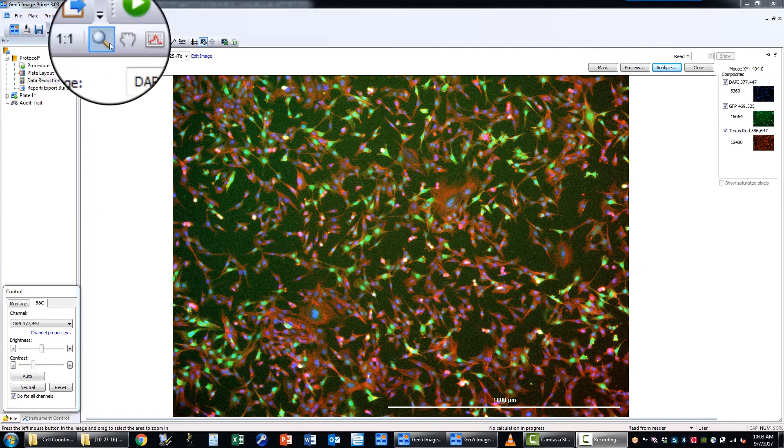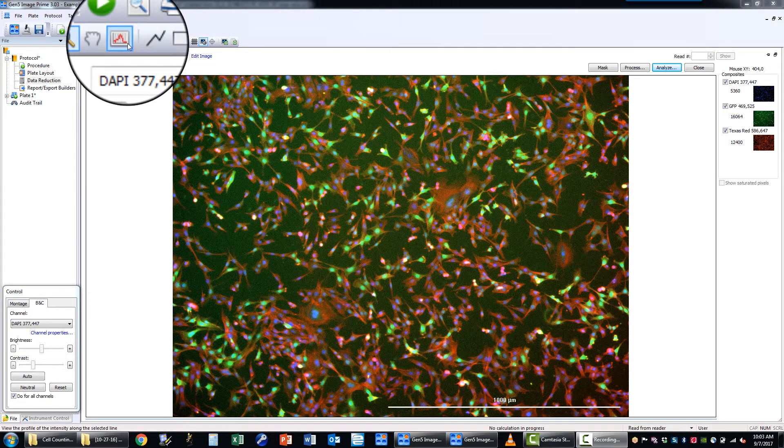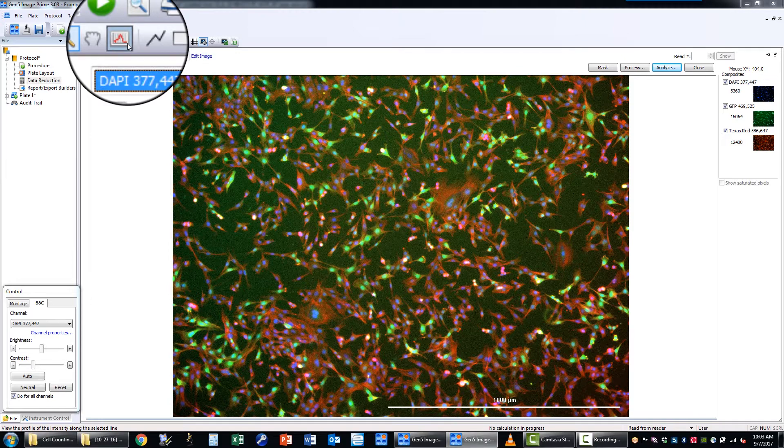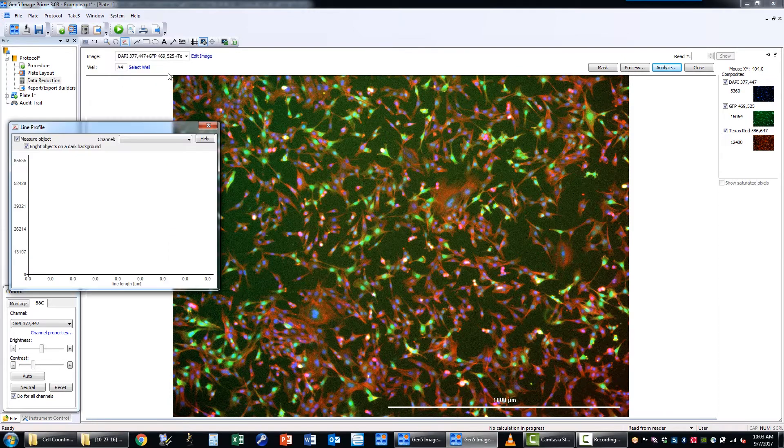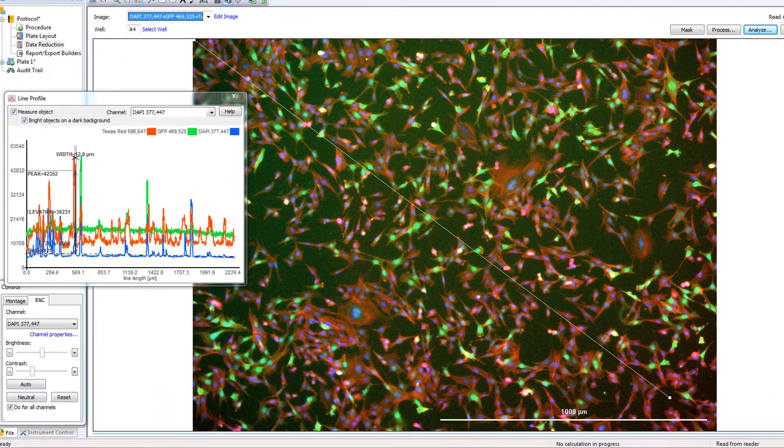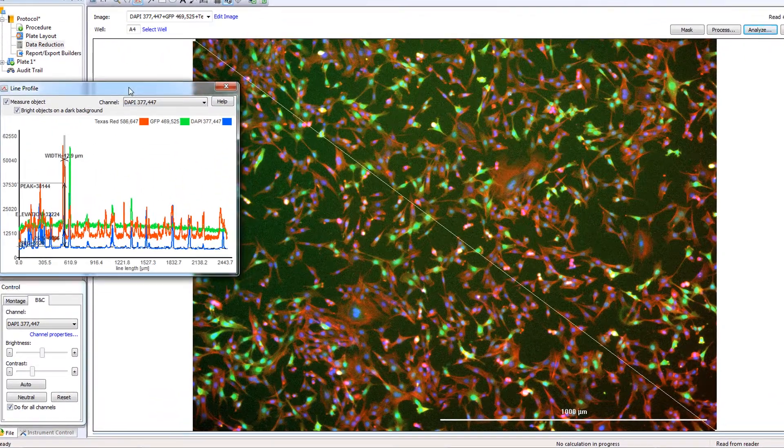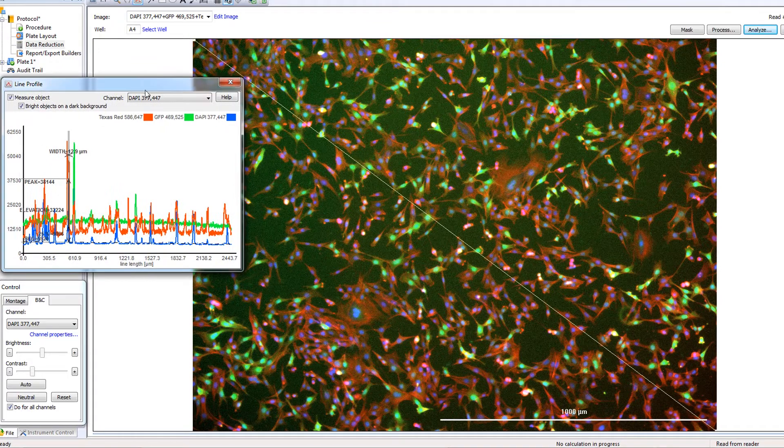Advanced image preprocessing tools like the Line Profile Tool and Background Flattening help obtain quantitative measurements from the acquired images with high accuracy and precision.